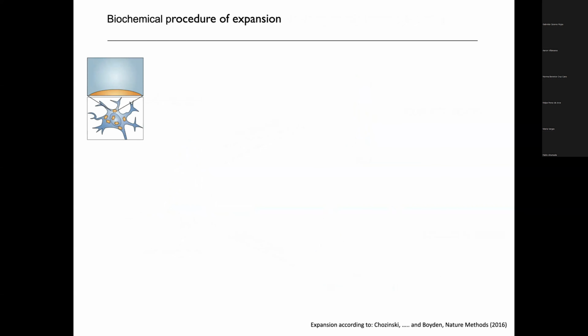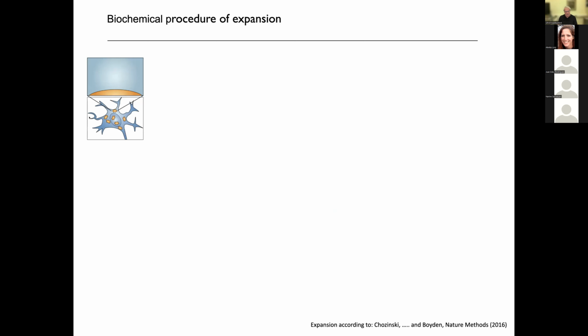So how is that expansion brought about? I have here a sketch. We see here an example of a single cell and some proteins that are located in these cells. And what we are interested in is really to see the very details of these cellular or intracellular structures, which are shown magnified here in that upper part of that sketch.